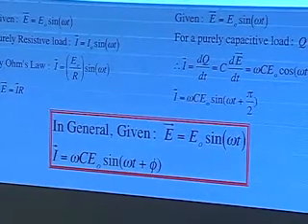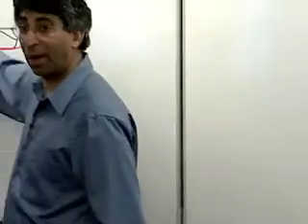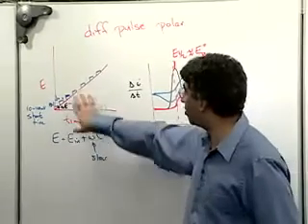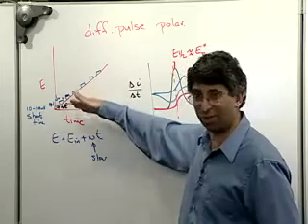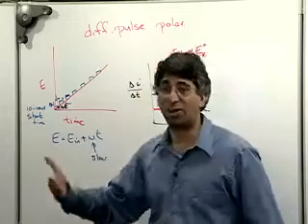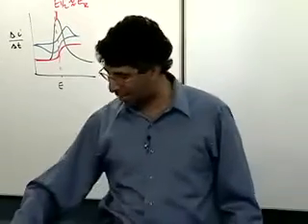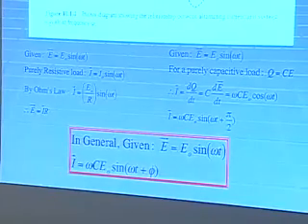Now, given that, there's a whole variety of techniques that one can use. For example, I might put that sinusoidal dependence on top of some sort of a linear ramp, and that's called AC voltammetry. It would have, of course, similar advantages to doing something like this. And since I would maybe be using a much higher frequency signal, I'd get more of a derivative. So there are things like that one might do. You can get fancy, for example, instead of looking at the primary harmonic coming out of this, you might look at the second harmonic of the current instead of the fundamental. That can give you some sensitivity and remove some baseline and things like that.